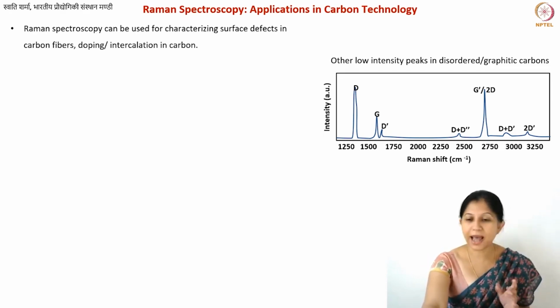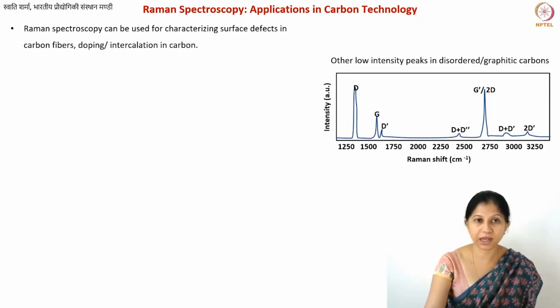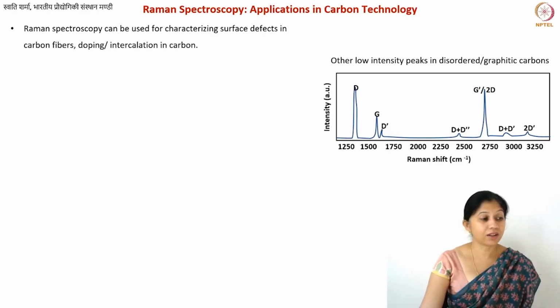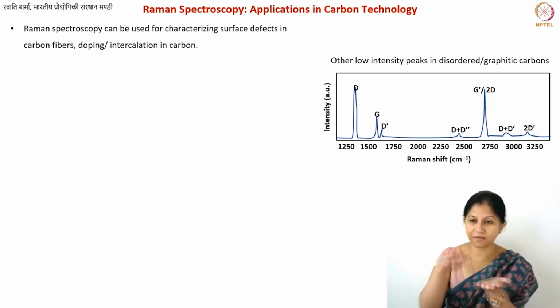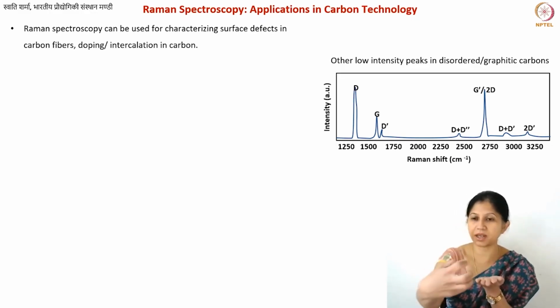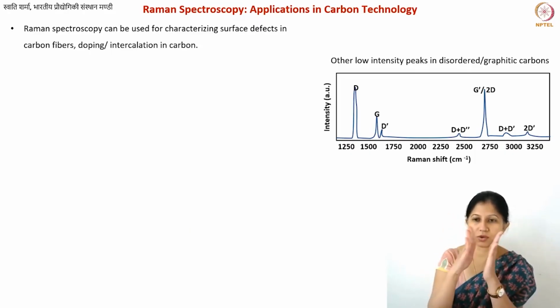Okay. What are the applications? We use it for characterizing the material when we are performing heat treatment. So this is definitely one application. Other than that, it is also very interesting when you have intercalation compounds. Intercalation means you have these two layers of your graphite, right? If something goes inside and comes out. So let's say there is some little ball which goes inside between my hands. These are the two layers. So this is your intercalation.